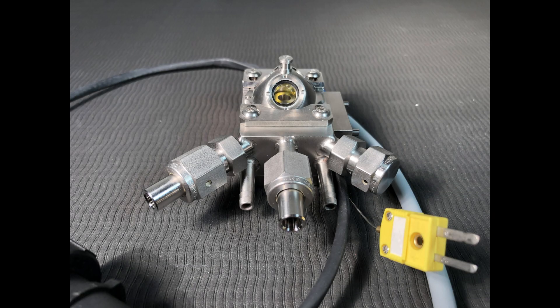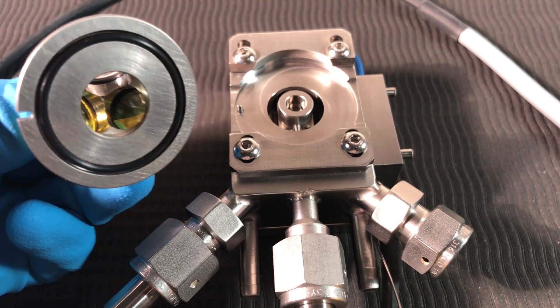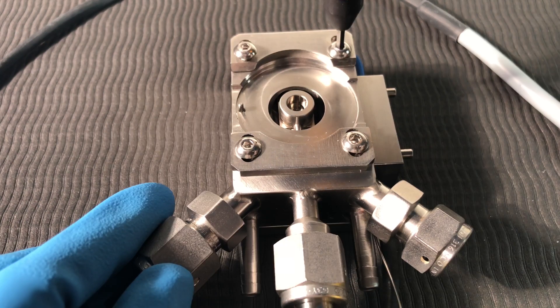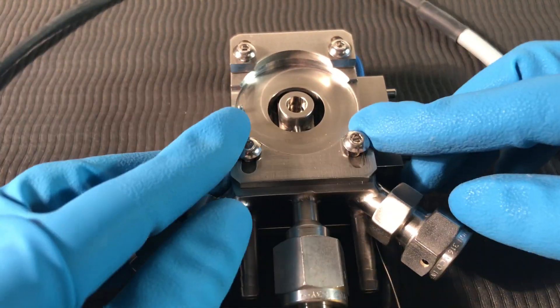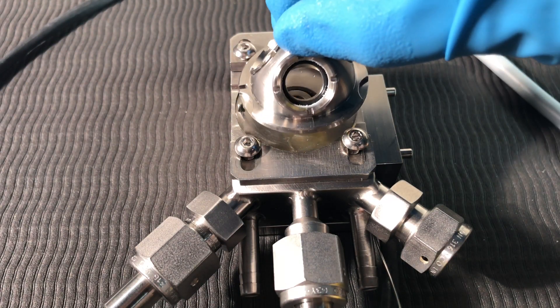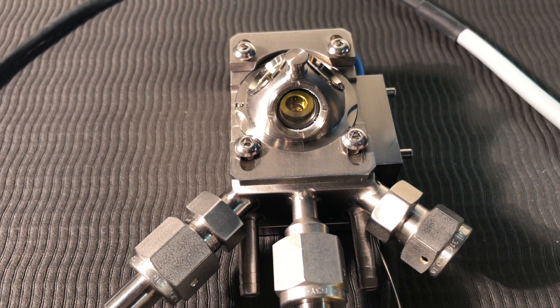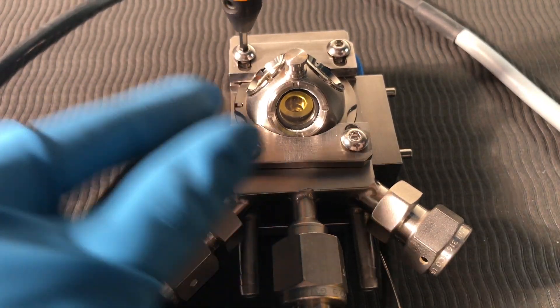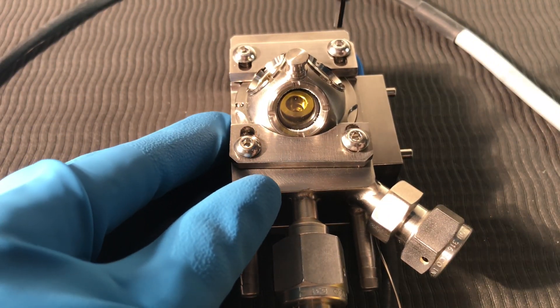Although it is not necessary to install the dome until later, it is recommended to become familiar with the procedure before proceeding. Prior to installation of the dome, make sure the O-ring and the groove on the bottom of the dome are clean and free of dust, and clean the mating surface where the dome sits on the HVC. Retract the retaining plates as far as possible, install the dome ensuring the orientation slot engages the orientation pin on the HVC, slide the retaining plates over the rim of the dome, and tighten the retaining plate screws.